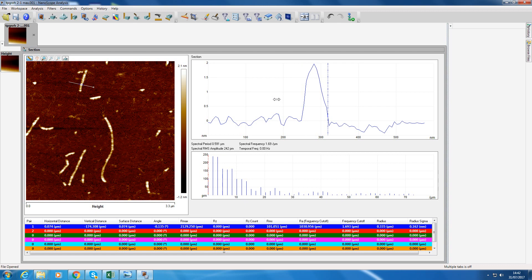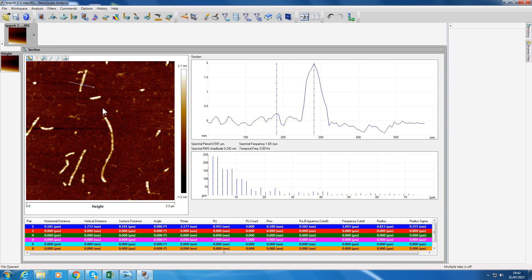You can even measure a height. Put that on the background, put it on the peak. Vertical distance: 1.733. So you can go around making loads of measurements and then write them in your book, and then you can do all the usual standard deviation, meaning standard deviation type things.